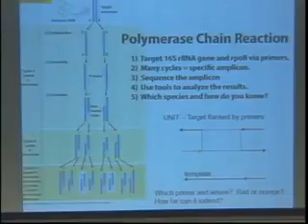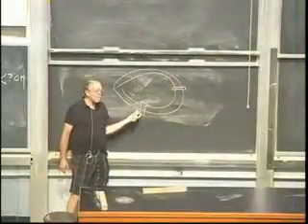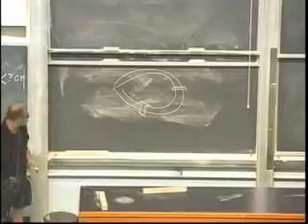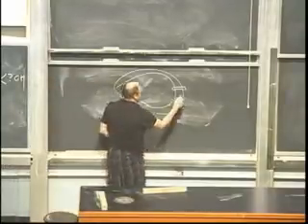So the way we target those 2 specific loci is we have primer pairs. They come in pairs. One is called forward, one is called reverse. So one will bind like that, the other one will bind like this. This is a primer pair for this genetic locus. If you want to call this one the forward, fine. If you want to call it the reverse one, fine. It doesn't matter as long as you realize they come in pairs, one called forward, one called reverse. There's no convention about which one's which. Likewise, the other locus will have a different set of primer pairs. But again, the key aspect is they come in pairs.